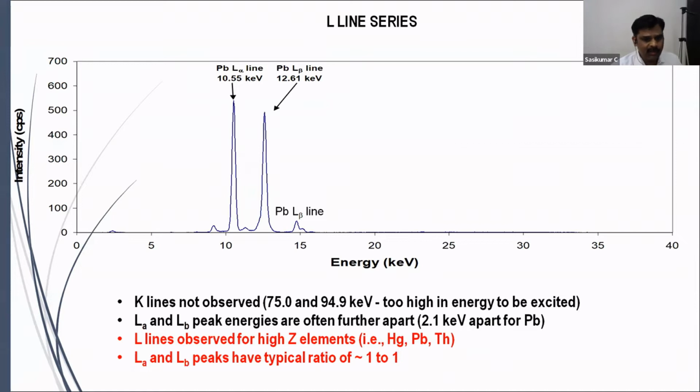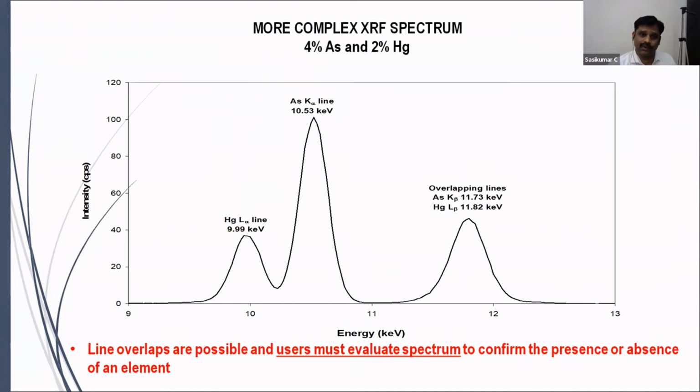And L lines will be more clearly resolved. So sometimes K lines may be mixed with something else and not give you a clear result, so L lines may give you better intensity, and may give you a better analysis.